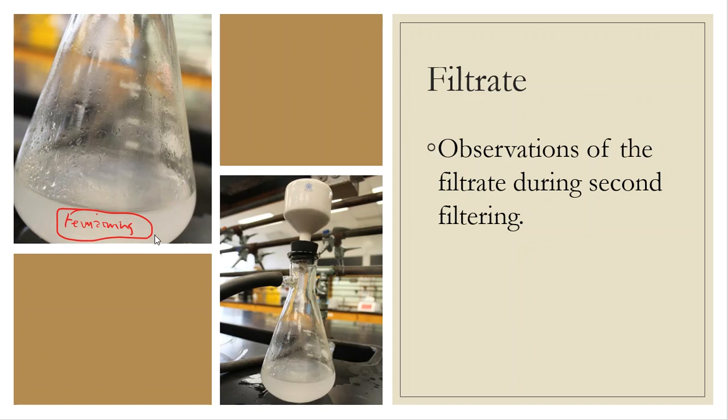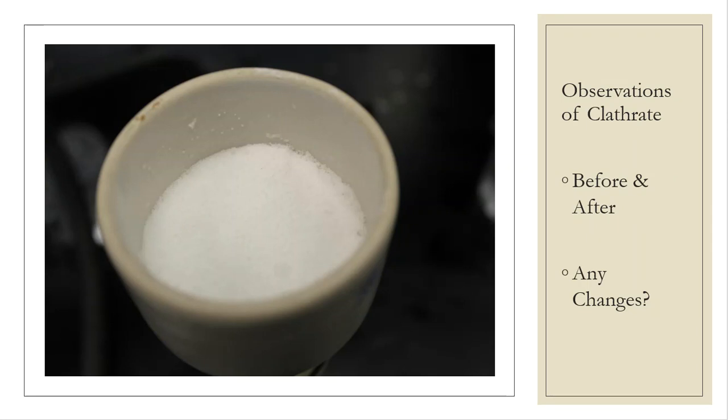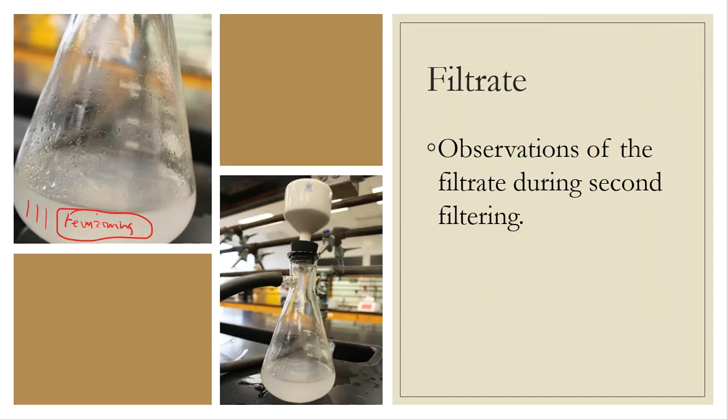I feel really good about the amount of quantity that I have in that Buchner funnel. And then in addition, like I said, there's no immediate formation of any solid that's down here at the bottom. So maybe it will never precipitate out because there's nothing to precipitate out. It's just a cloudy solution. So once more, I don't want to waste my time just to test that hypothesis, right?